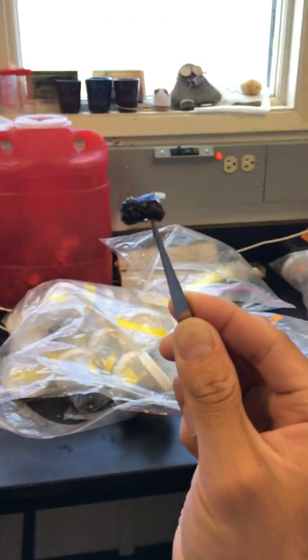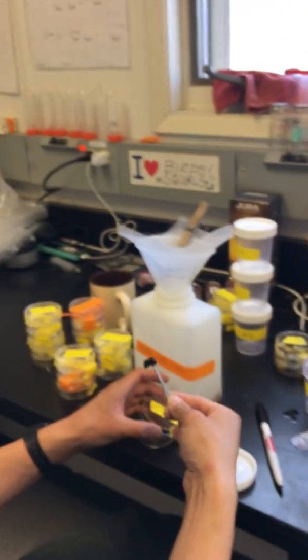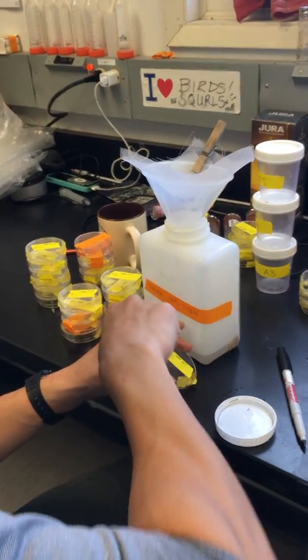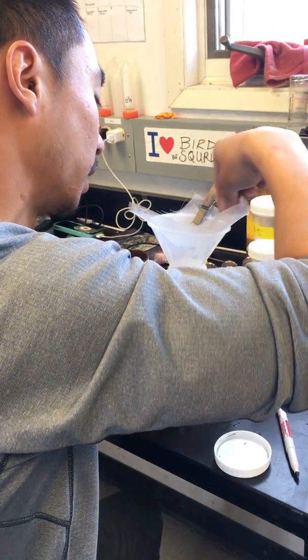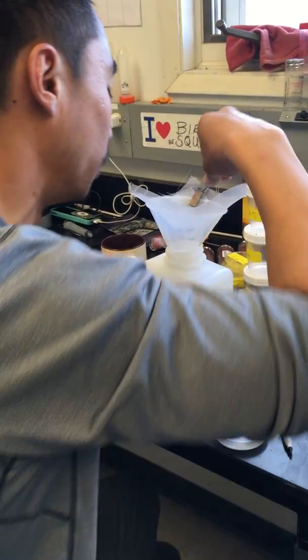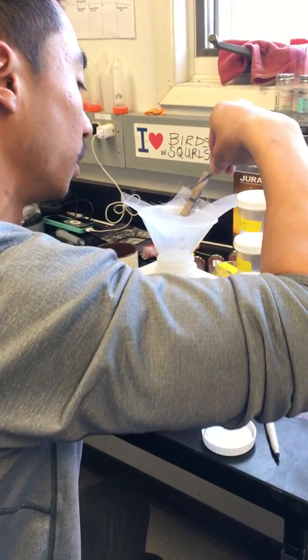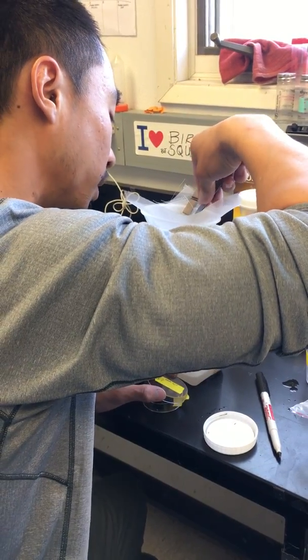And you do this to measure biomass, right? Yeah, so basically the amount of food available for the birds. And then you dry them? Yeah, we dry them for 48 hours in the drying oven, 125 degrees Fahrenheit. And then once they're all dry, we just weigh them, and that's how we measure how much food the birds have available to them.